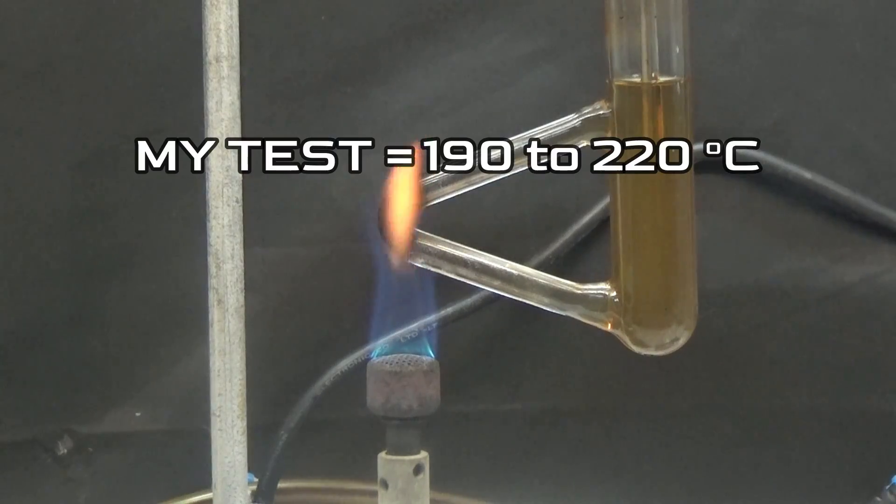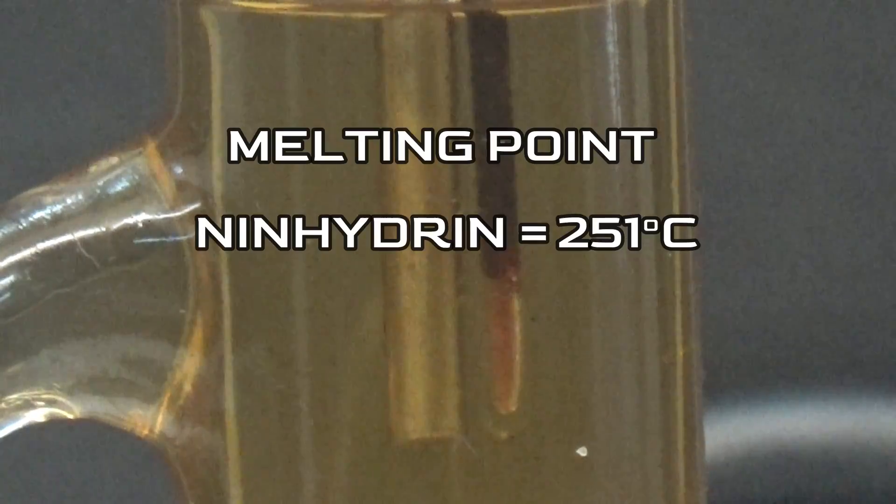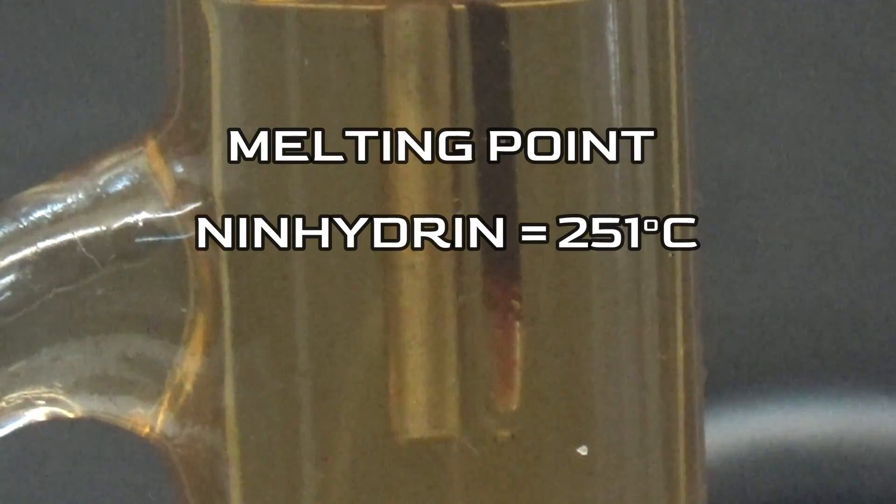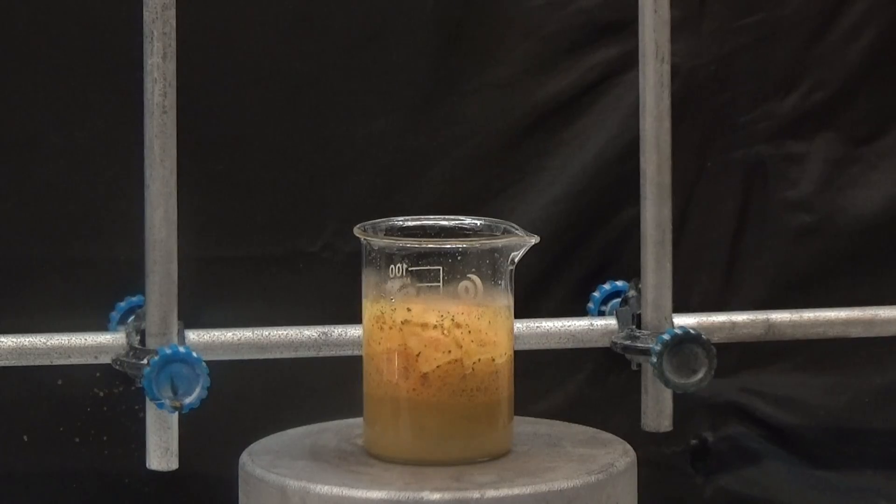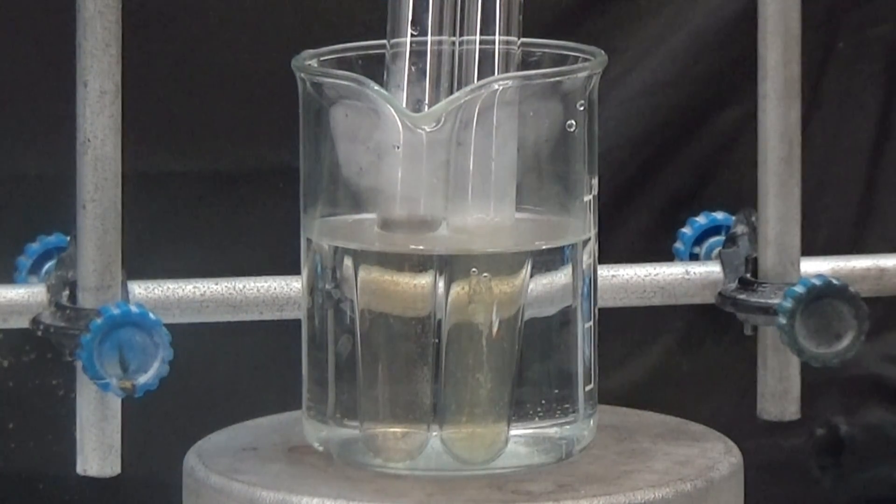The melting point of ninhydrin was determined to have a purity of 190 to 220 degrees. The ideal temperature for pure ninhydrin is 251 degrees. The ninhydrin obtained may be contaminated with residues from the reaction. I tried to purify it by recrystallizing it in various solvents, but there was no success. Finally, I was satisfied with the positive result as a reagent for amino acids.